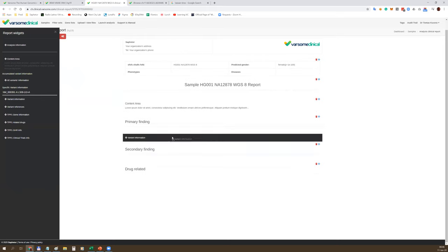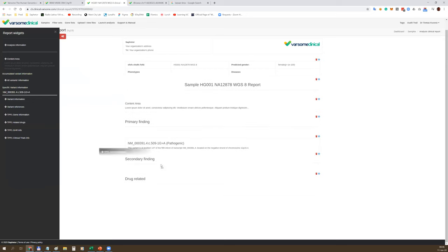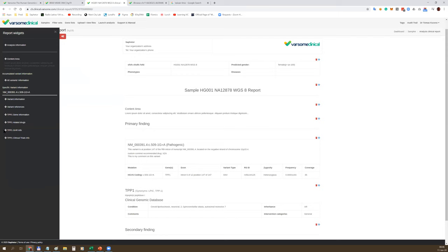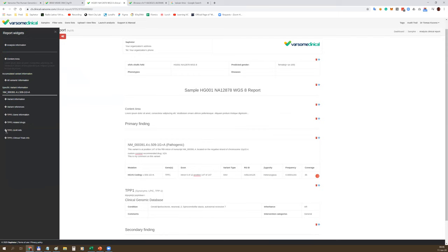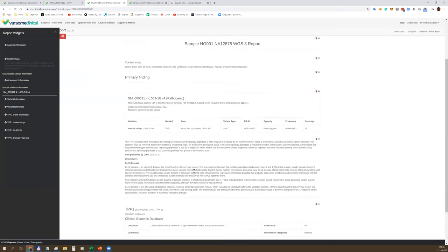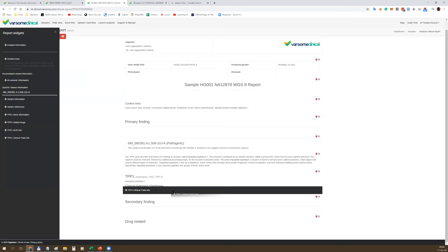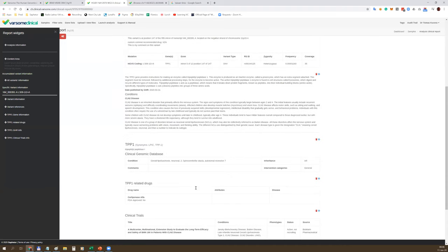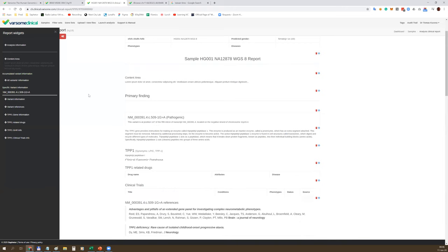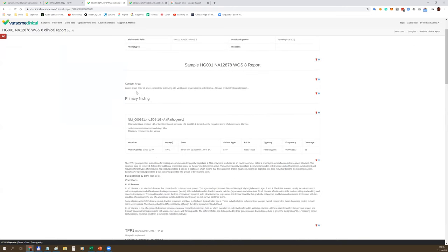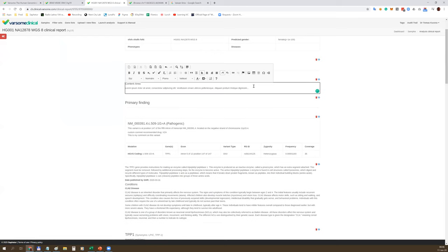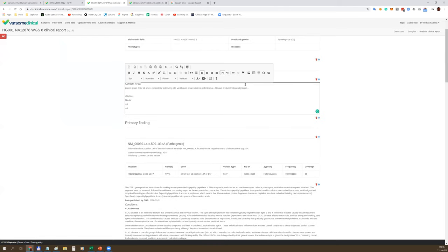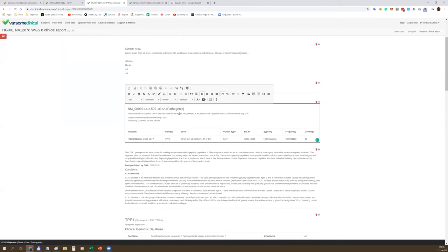You can upload your own logo, set up the header, use your own colors, fonts, and styles. The common elements can be translated into any language. The content itself is always in English because that's pulled down from public data resources. However, the common elements can be translated into any language. You also have control over the data. On the left side, you can see the list of widgets - the list of annotation data pieces. You can drag in the content area, for example variant information, clinically relevant information for genes, list of clinical trials, list of drugs, and at the end, list of publications.